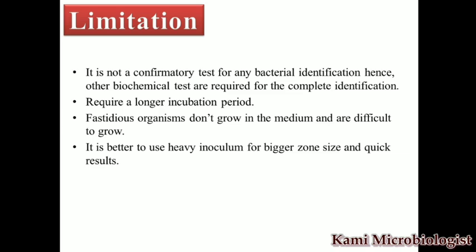After 3 days they can show the result. Another most important thing is that fastidious organisms do not grow on this media, and thus it is very difficult to identify this type of bacteria. And one more thing, if we want to get a big, clear and quick zone, we have to take a heavy inoculum.